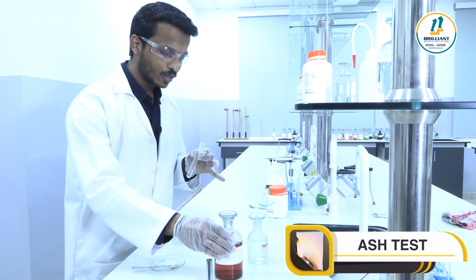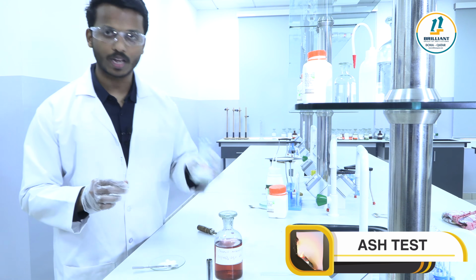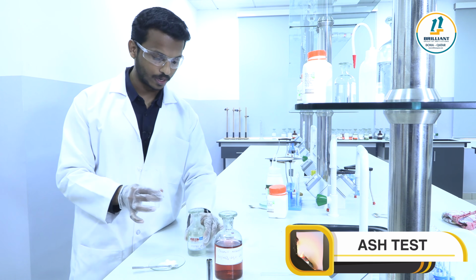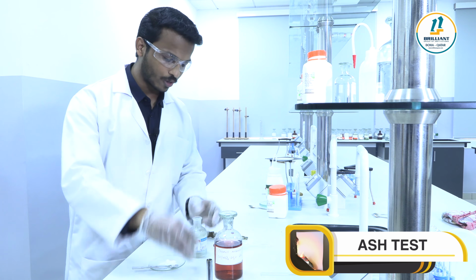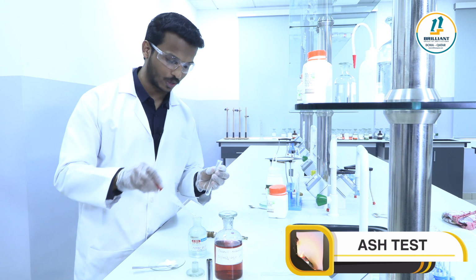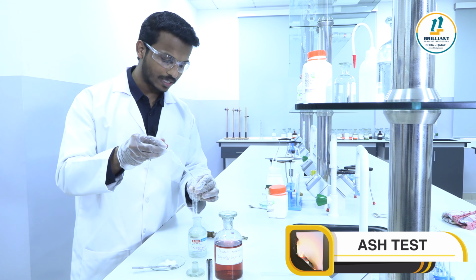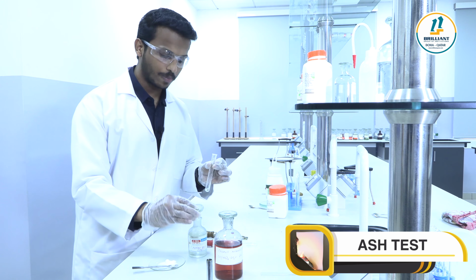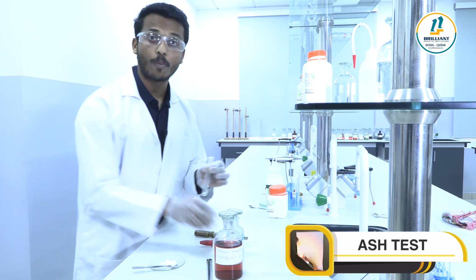Let me add concentrated nitric acid. For the ash test we are using concentrated nitric acid. After adding a few drops of nitric acid, let me add some cobalt nitrate.